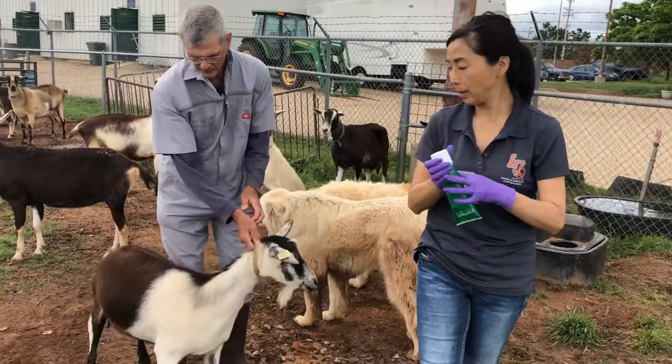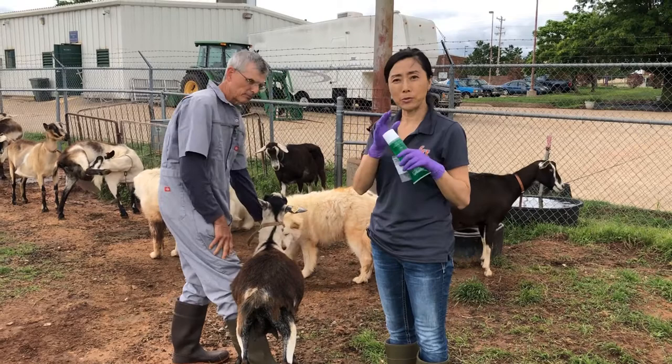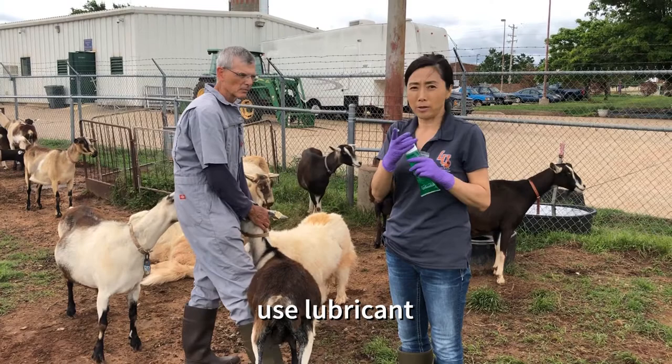We want to collect from the rectum. It's personal, but I don't want to use a dry finger, so I usually use a kind of gel or lube — whatever you have. Probably just water helps too.